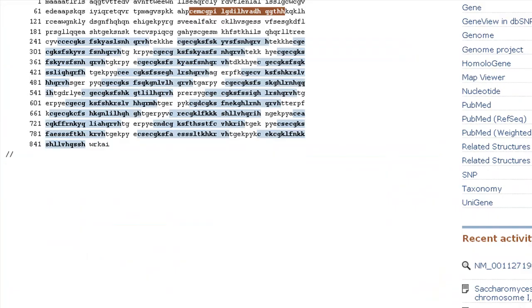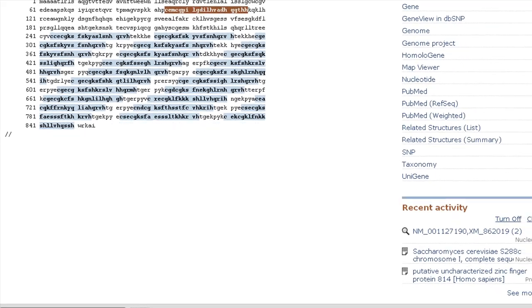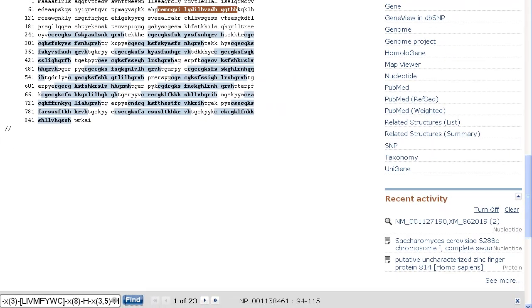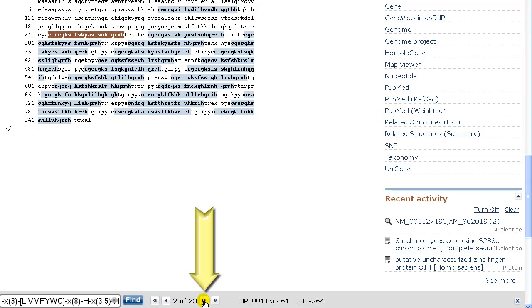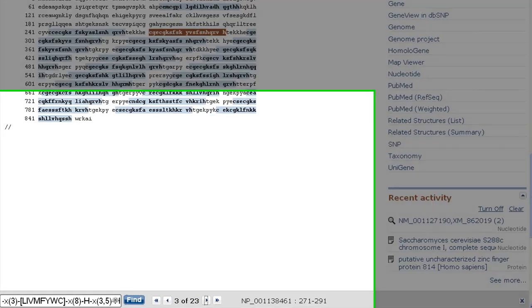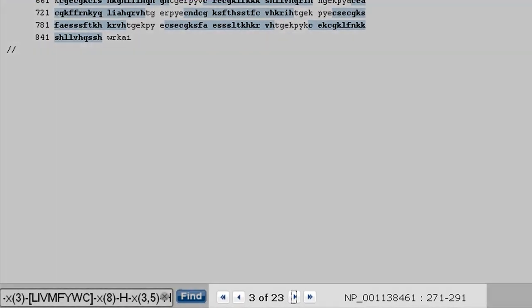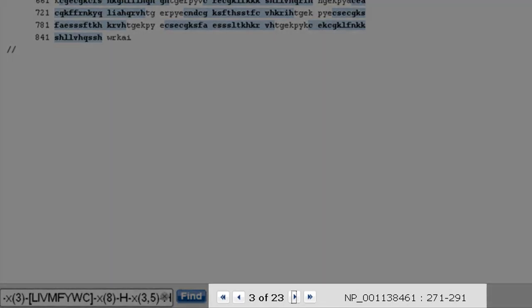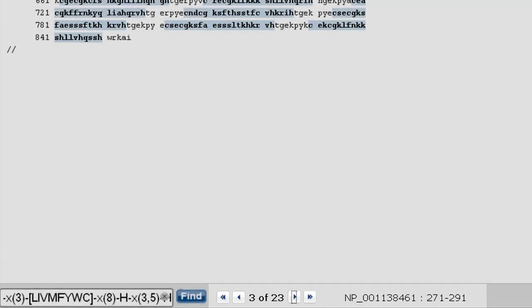The first match is highlighted in a different color than the subsequent matches, which you can scroll through with the controls. The total number of matches, as well as the coordinates for the selected reddish pattern, are also displayed.